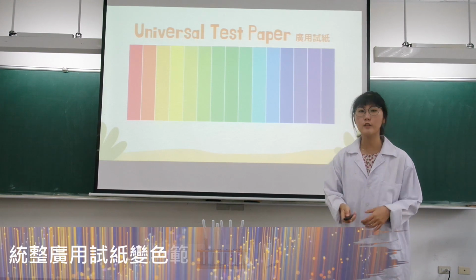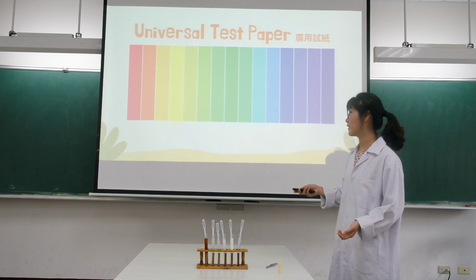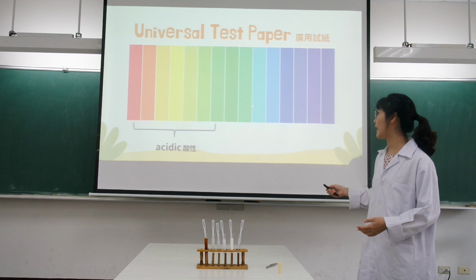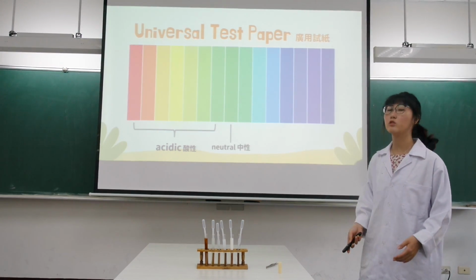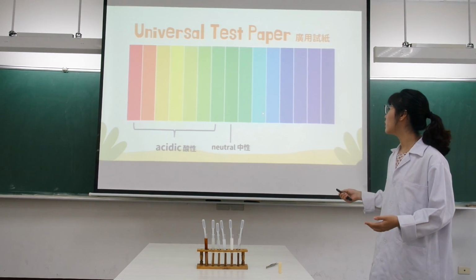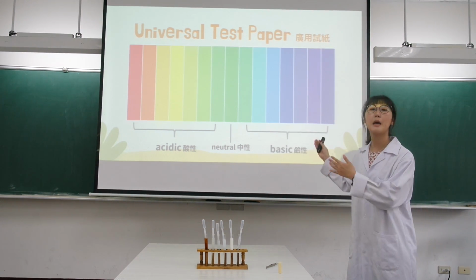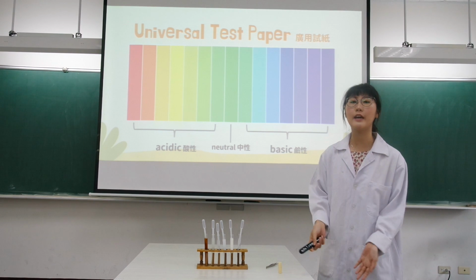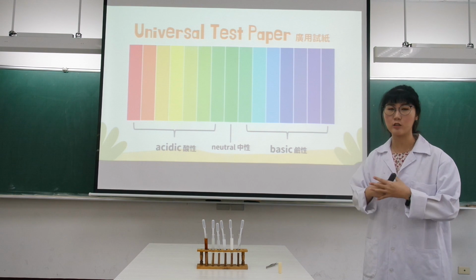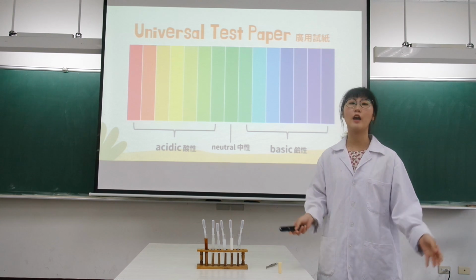So, if the color turns to red, orange, yellow, like this, the solution is acidic. And if it's green like this, the solution is neutral. And if the test paper turns to green, blue, purple, then the solution is basic. Okay, so now look at your worksheet and look at your test paper to see if they match. And then look at the guess you made and see if they are the same.